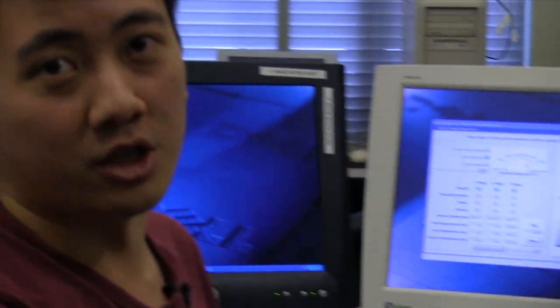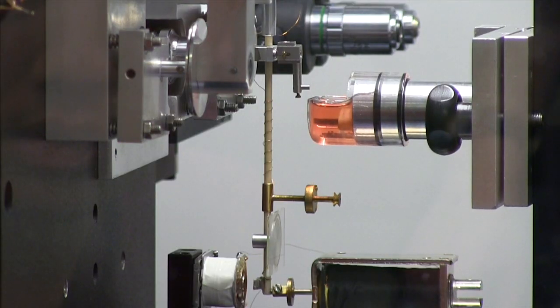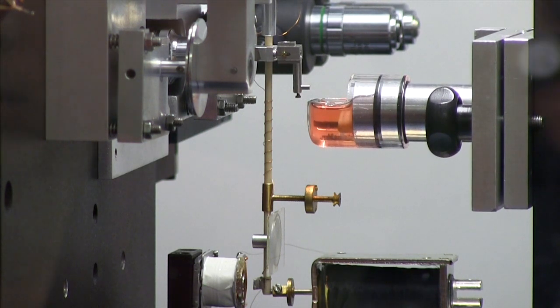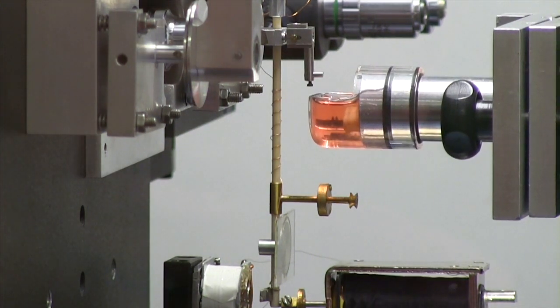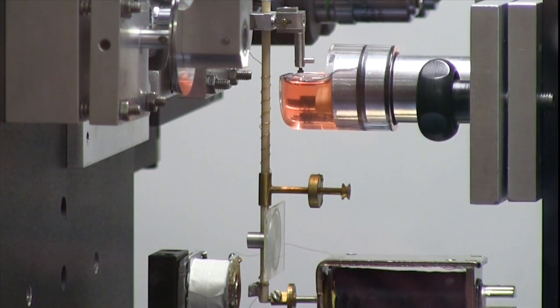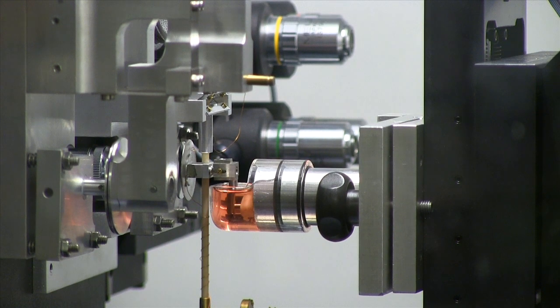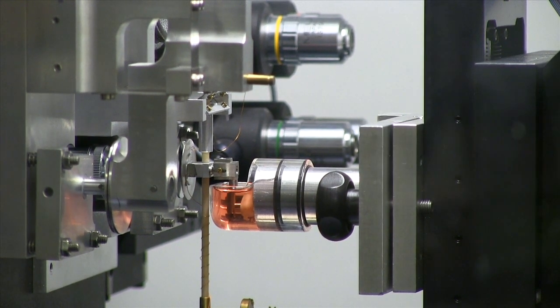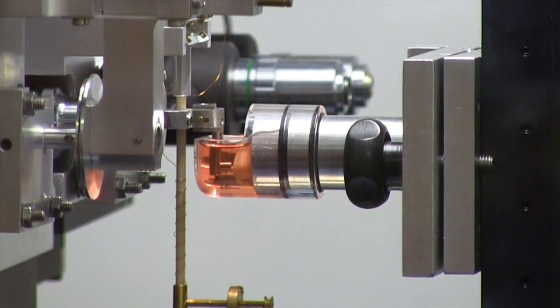Now I'm done with the calibration and I'm ready to shift my sample stage down and to the left and then back up so that the probe is inside the fluid cell and can make contact with the brain tissue sample. You can see that the probe just got submerged in the fluid. So now I can make contact with my brain sample and start the test.